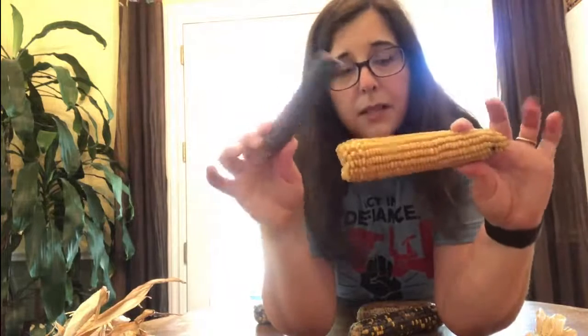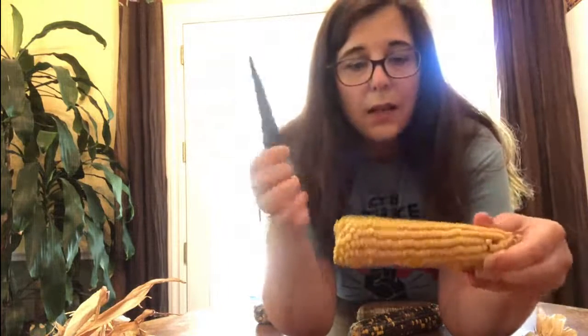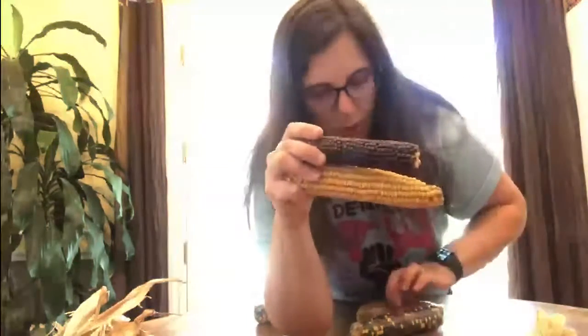But now we're going to add in a second phenotype, and that second phenotype has to do with the shape of the kernels. I know you're looking at these two cobs and you're saying, well, the red one's really tiny, but that's not the trait we're looking at. We're looking at the individual kernels, and we're going to try to figure out the ratio of offspring that share parental traits and non-parental traits.